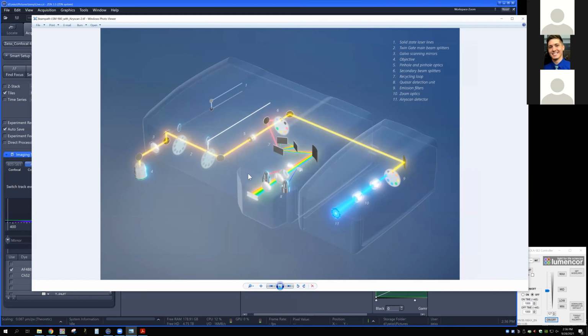But if you remember what I showed you in the slides earlier, we can basically use these 2 side detectors. They don't care about spectra really, except for what the prisms send to them. So these 2 detectors on the side are going to eat photons, detecting them no matter what wavelengths they are.